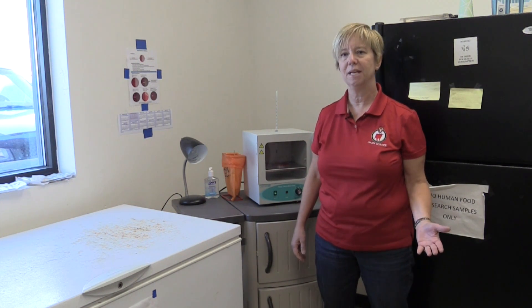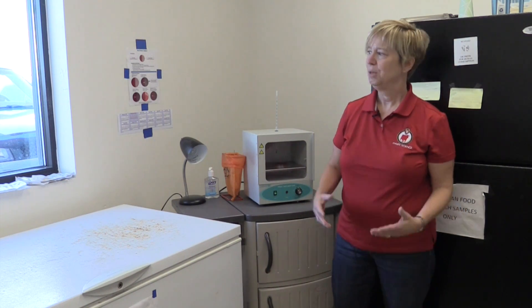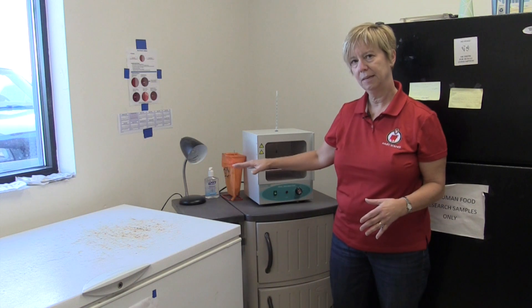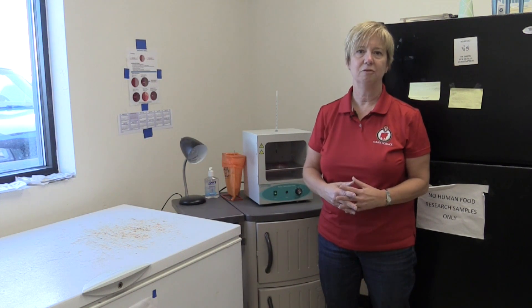One of the most important things if you're thinking about using an on-farm culturing program is to select the right workspace to set up your laboratory. It's very important that this workspace is not a food preparation area for employees, because we're going to be growing microorganisms and for safety purposes we want to keep those functions separate. We'd like to have a well-lit area so that we can properly read the plates, and we want surfaces that are easily disinfected after we're done inoculating and reading the plates.